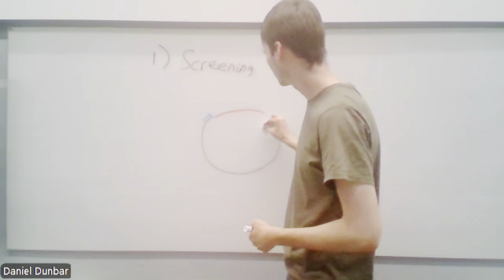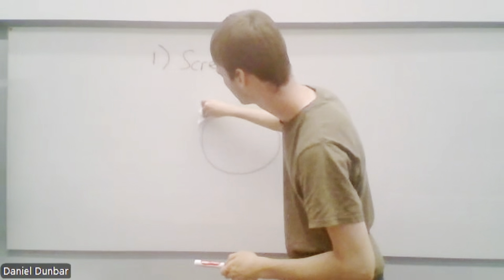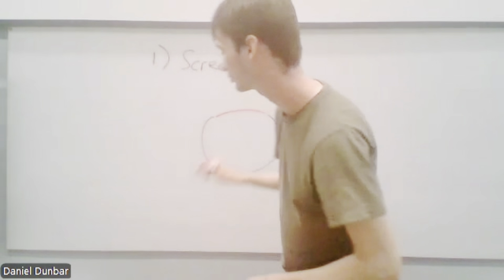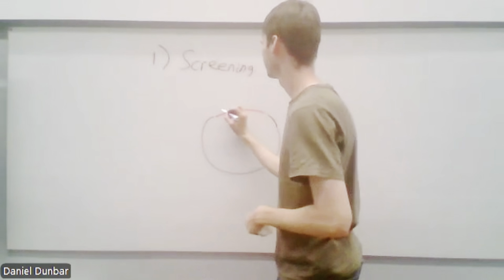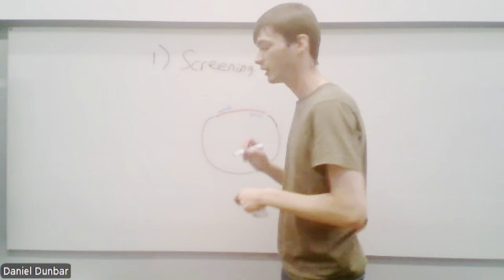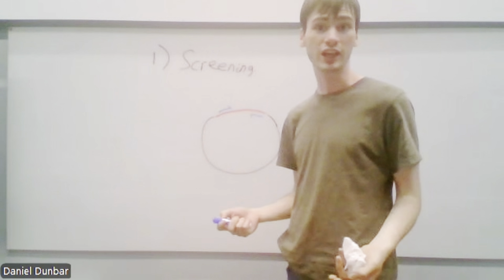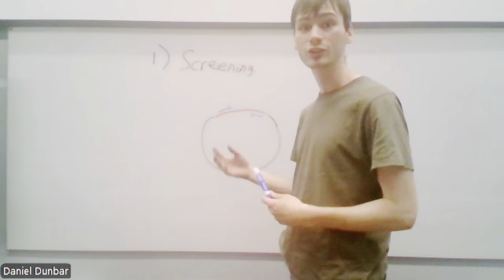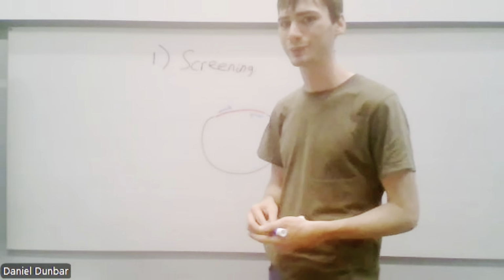An alternative option is you can put primers just inside the sequence. In fact, yes, in this case both of them would be just inside the sequence. And in this case, you would then run the result on a DNA gel to check for length. And if the length is what you expect, then you can say, okay, my insert is in there. And otherwise, you wouldn't see any amplification.